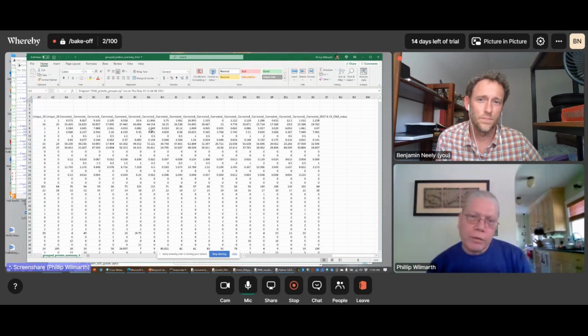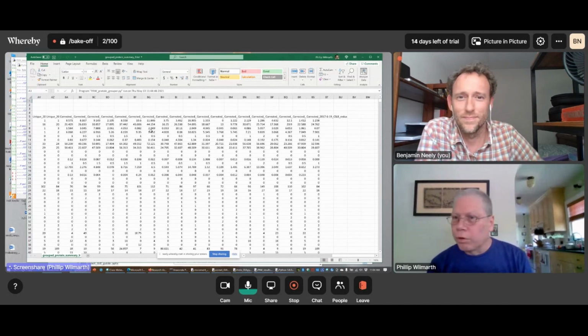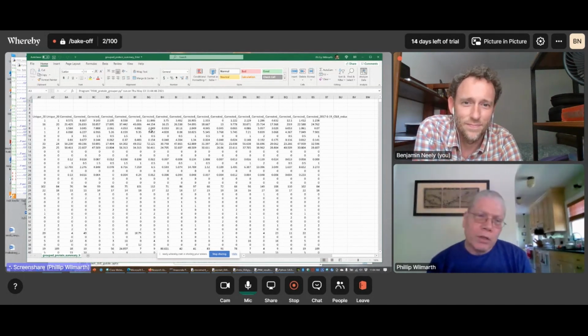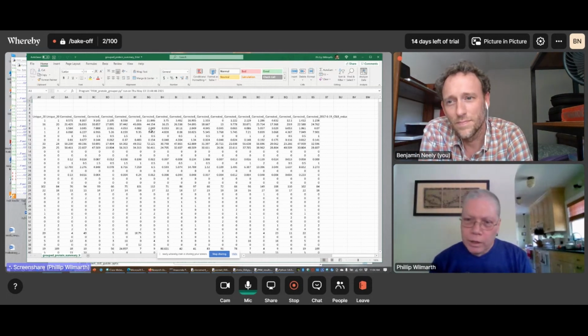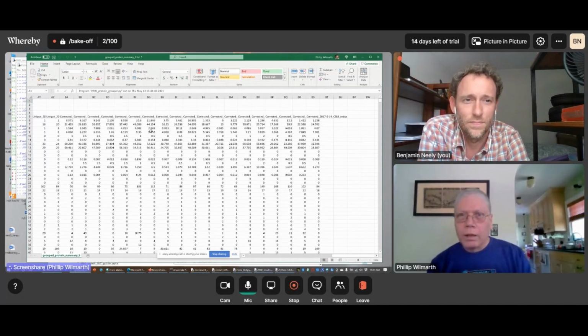So this is a way to try to come up with a little bit better total spectral count quantities for proteins if you're doing a spectral count comparison, which this pipeline is old enough that it was really developed for spectral counting. And then I've used the same framework to add TMT reporter ion, an extra hidden dimension for TMT support. But the TMT stuff is pretty much just added on at the end. So the basic function of the pipeline is pretty much the same, whether it's a TMT experiment or spectral counting like this. And that's pretty much it on the basic pipeline.